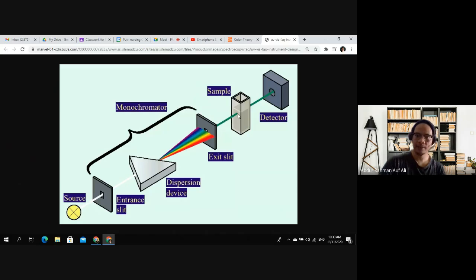Okay, and bila dia absorb the light, cahaya yang dipancarkan after this solution ni, intensity dia, keterangan dia sudah berkurangan. So spectrophotometer boleh measure berapa banyak yang kurang. Kenapa dia kurang? Because cahaya sudah sedikit sebanyak sudah diserap oleh our sample solution.